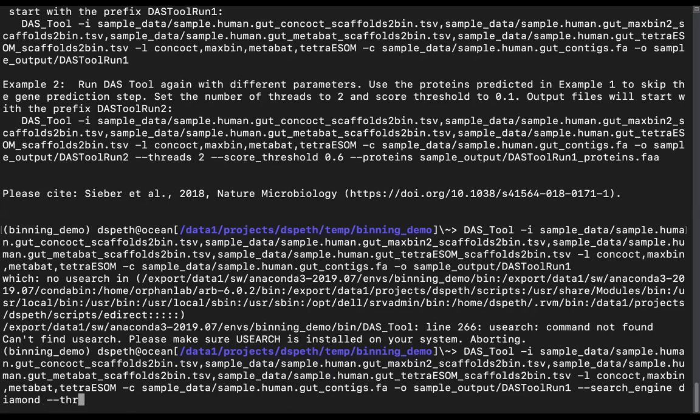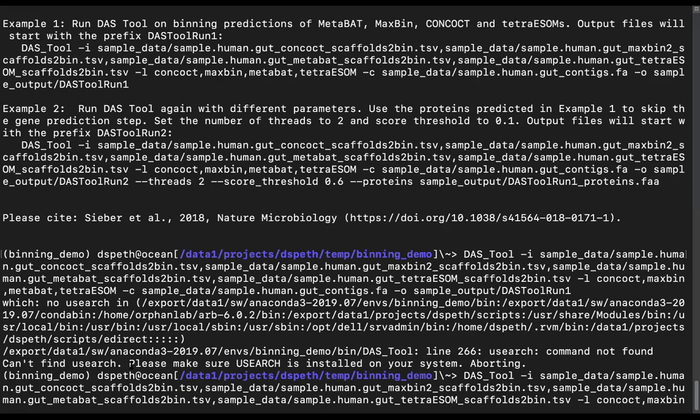For this purpose, I'm going to crank up the threads a little bit. This is not what you can do on your own computer, but if you have big data, you can't run this on a laptop, unfortunately.